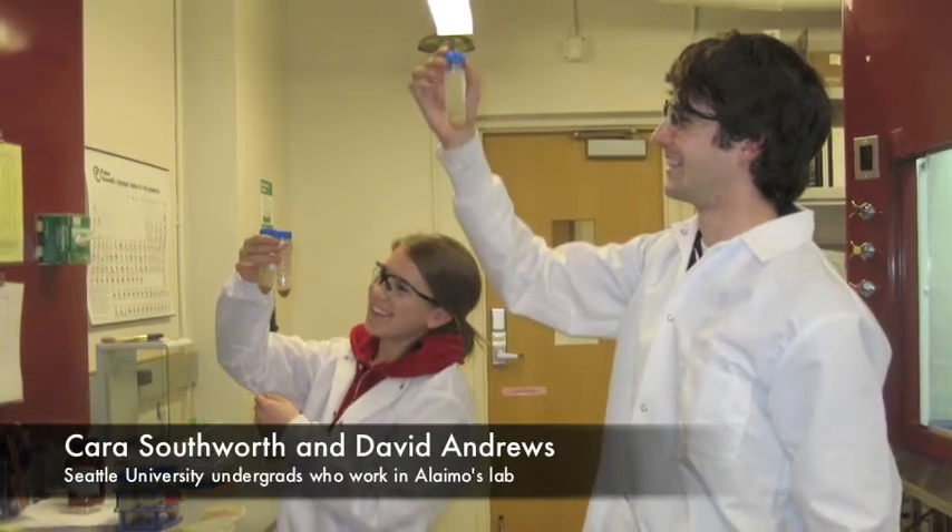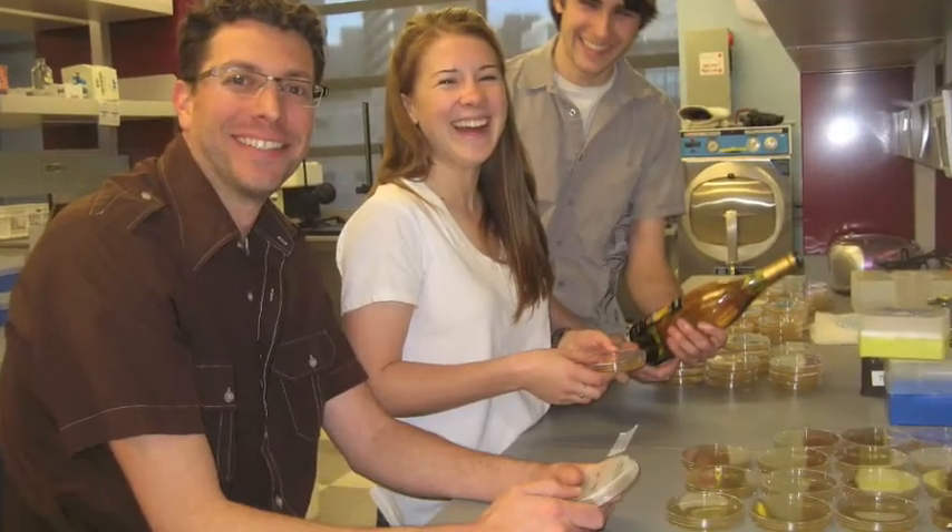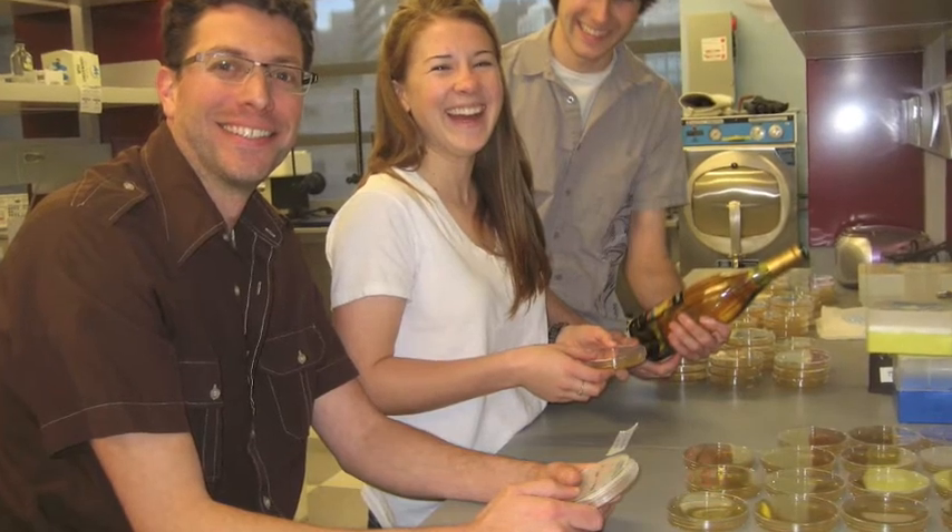The genesis of this project came from a bunch of winemakers working in Woodinville making a variety of different wines. The problem they're interested in solving is a very practical decision: determining the minimum amount of SO2 that needs to be added to a wine before the yeast are done fermenting all the sugar — that is to say, the wine is a little bit sweet. The goal is to stop the fermentation but not have so much SO2 that the aroma of the wine is compromised, because SO2 doesn't smell very good.